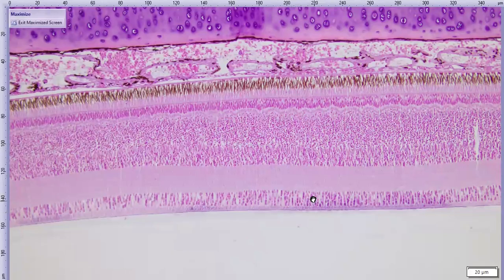through the ganglion cells. Also notice how thick the inner nuclear layer is. And I know almost nothing about this, but I'm told that compared to the mammal, neural processing occurs to a much greater extent in the retina as opposed to the brain, so that the image that goes to the brain is already somewhat neural processed. And I don't have any better words than that to describe it.